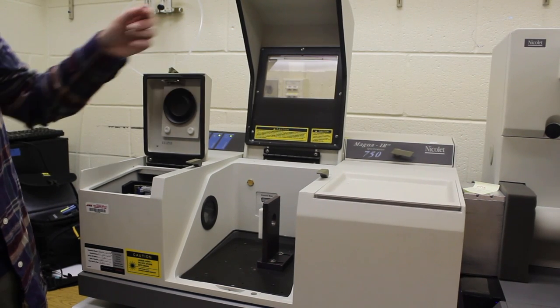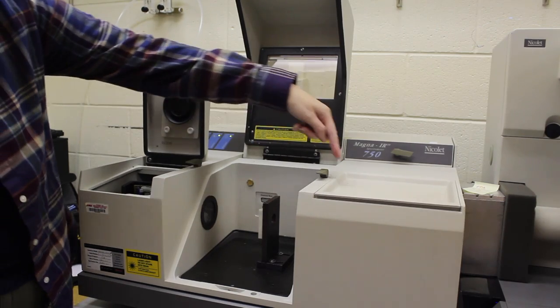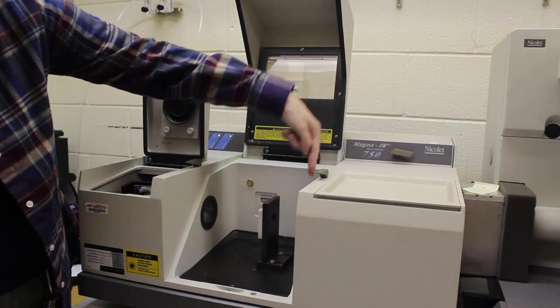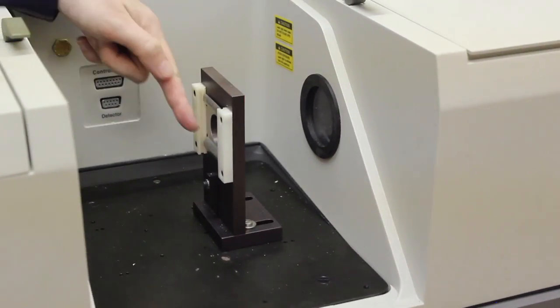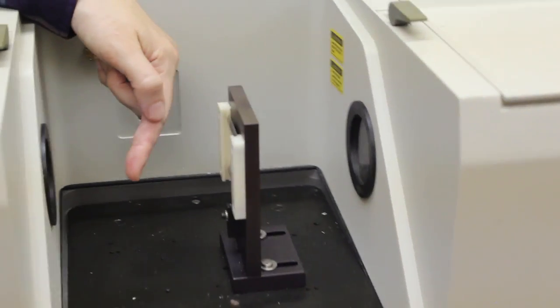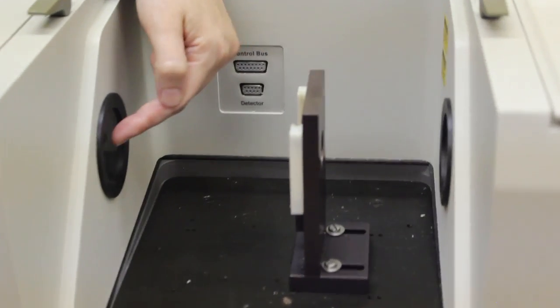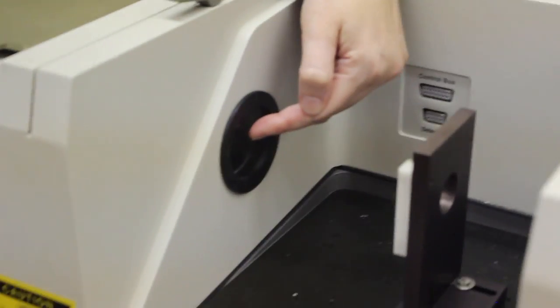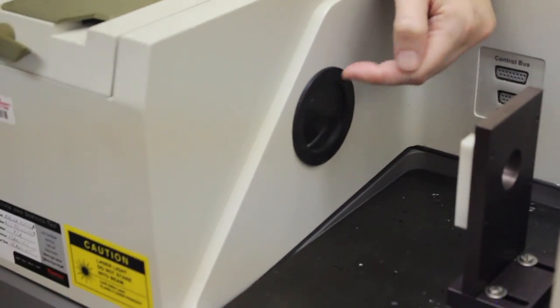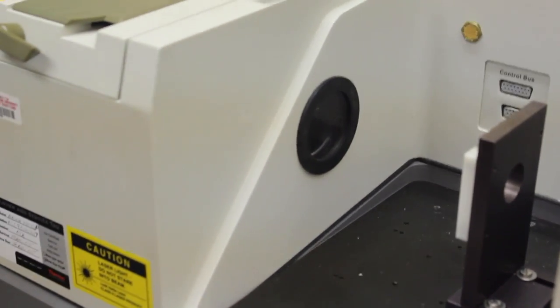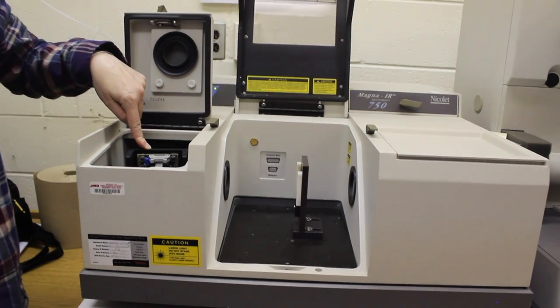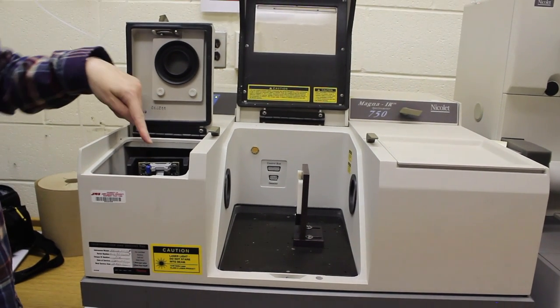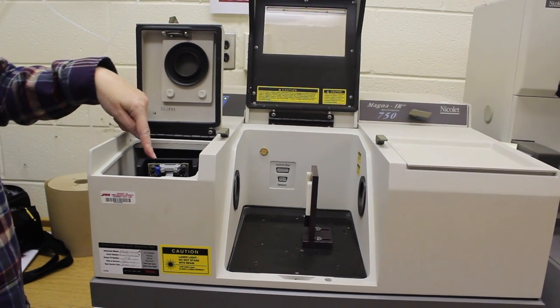The light from the FTIR spectrometer passes through the main compartment and through the sample, then enters the detector through the window here. This is a DTGS detector on the instrument.